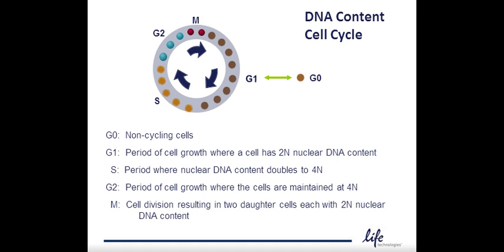Often in talking about cell cycle in flow cytometry, we describe the distribution of a population of cells in the different nuclear phases. DNA content analysis is one of the most widely used applications in flow cytometry. During the S phase, cells undergo DNA replication, so that when they enter the G2 phase, they have twice the normal amount of DNA. Looking at the amount of DNA within the cell indicates the proliferation state of the population and can be used to examine the effect of drugs that affect the cell cycle, something that is particularly important to development and cancer research.